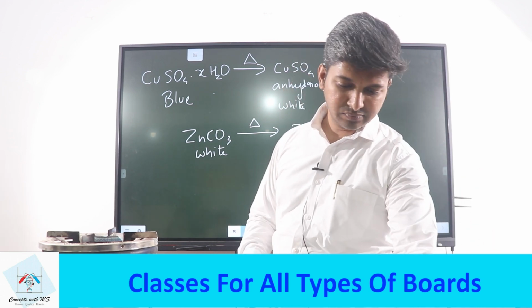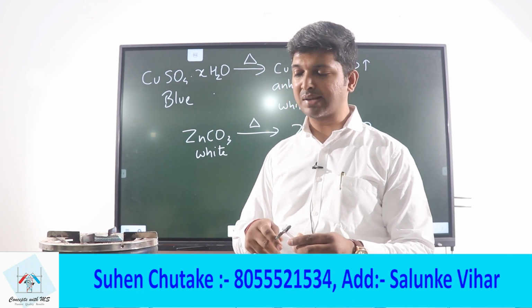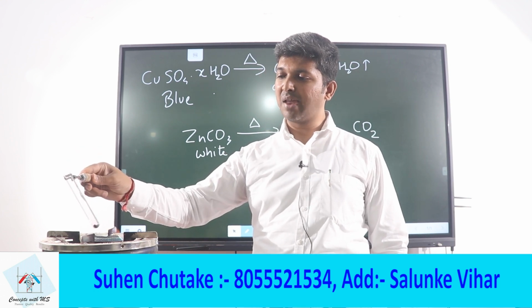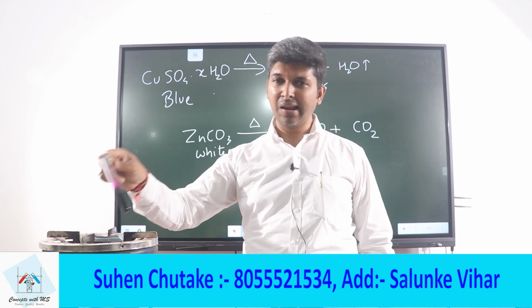Okay, then we have iodine crystals. Let us see what happens when iodine crystals are heated. You know, iodine crystals sublime, and you will be able to see violetish fumes over here. Can you see that? Please zoom in and have a look.